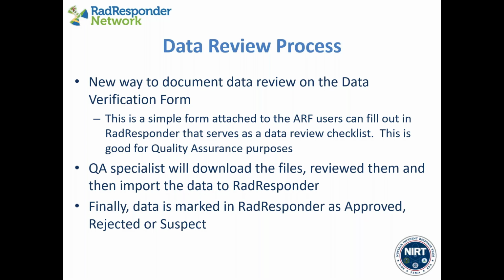So we have a new way to document our data review on the data verification form. This is a new form that's attached to the analysis request form that users can use sort of like a quality assurance checklist. And also it's a good place to document any issues you might find with the data. We have a position in the format called QA specialist. They're going to be going into each analysis request form, downloading the files, reviewing them, and filling out this form. The final stage is to get that EDD file and import it into RadResponder and mark that data as approved, rejected, or suspect.